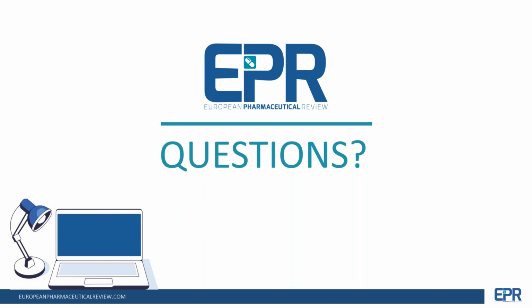Thank you very much. Also, should environmental monitoring during the filling process be included as a CCP? Well, no. As I said, to start with, environmental monitoring is certainly a critical control point for bioburden or for sterility. But the possibility of this causing a huge effect on the endotoxins is actually low. So environmental monitoring is certainly not a critical control point for endotoxins, no.